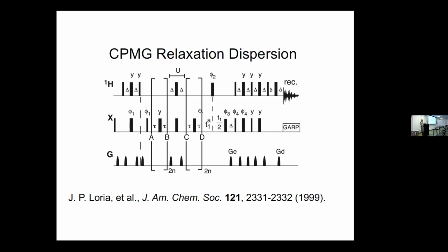And then we do the second half, so that we start with a lot of in-phase, build up a lot of antiphase, swap them, and then the reverse happens. And we come back as if the scalar couplings were averaged over the period.